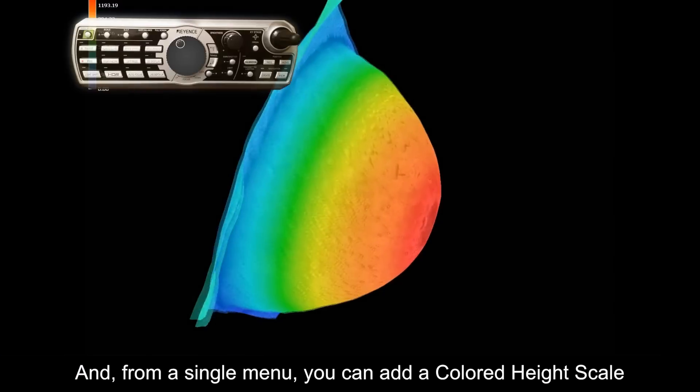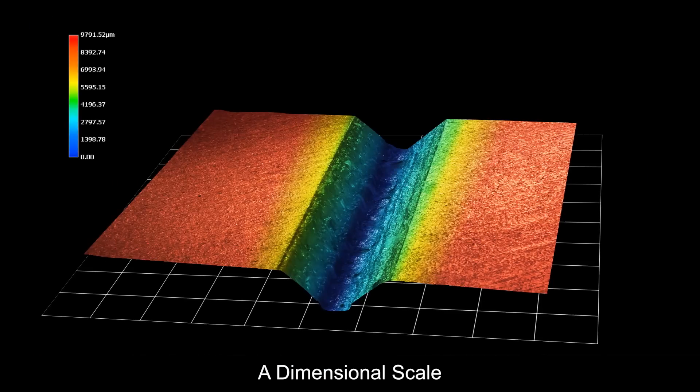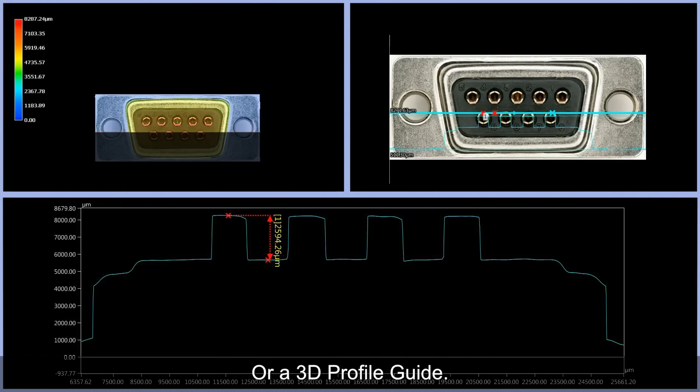And from a single menu, you can add a colored height scale, a dimensional scale, or a 3D profile guide.